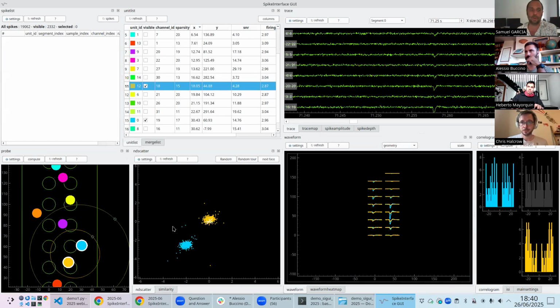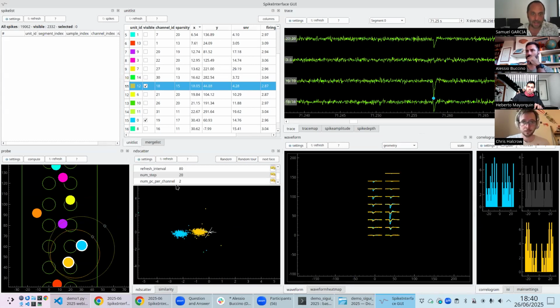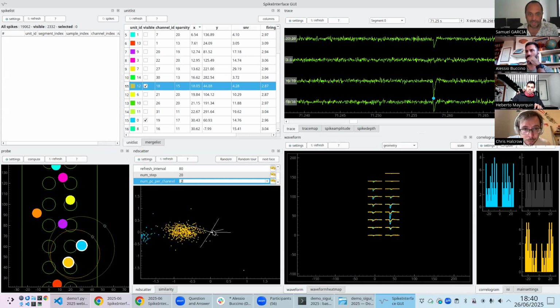And the idea of the PCA is you have many. For instance, if you want to compare the two, it's a few PCA per channel. So depending on the channel, let's say 5 channels or 4 channels, you can decide 2 PCA or 1 PCA per channel. But even with this, you still have maybe 6 or 8 components, depending on the channels. So how to explore high dimensionality?